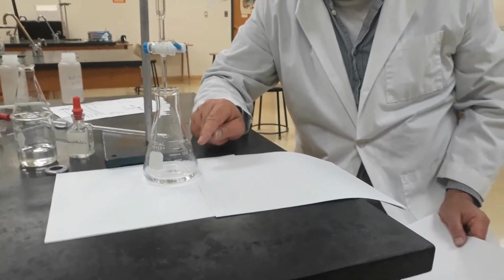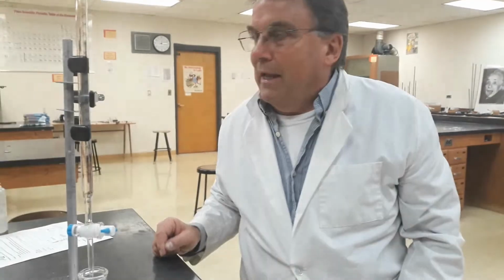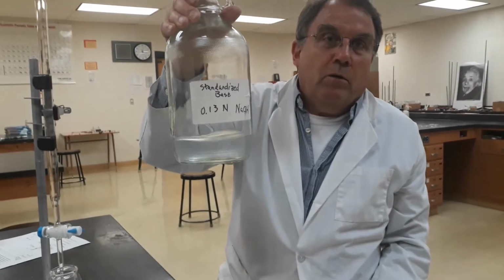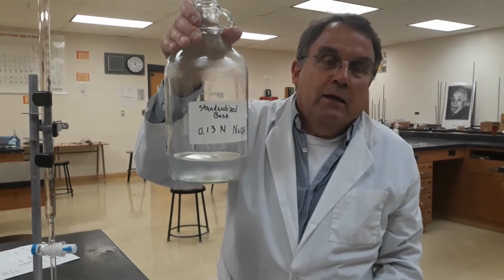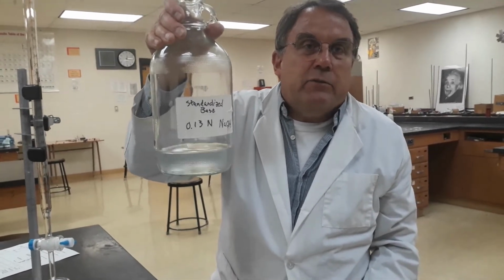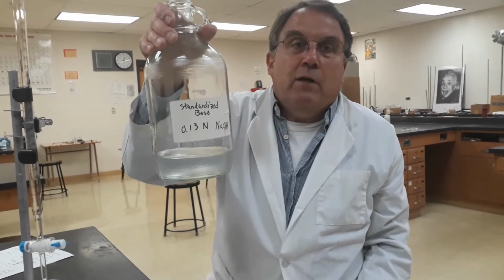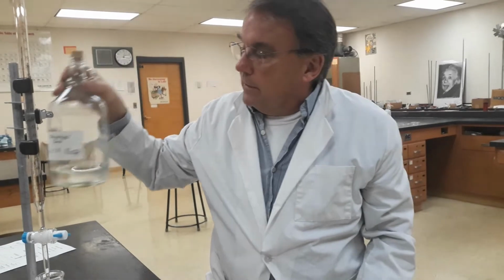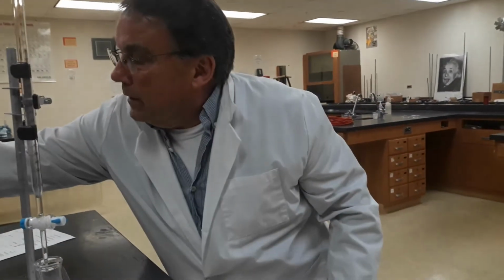Everything else is similar. The acid is the same for everybody. It's acetic acid, it's vinegar, so it's the same as the first titration. The concentration of the base is 0.13 normal sodium hydroxide. So we'll be adding acetic acid, HC2H3O2, to sodium hydroxide, NaOH. And then the products you'll be able to figure out.